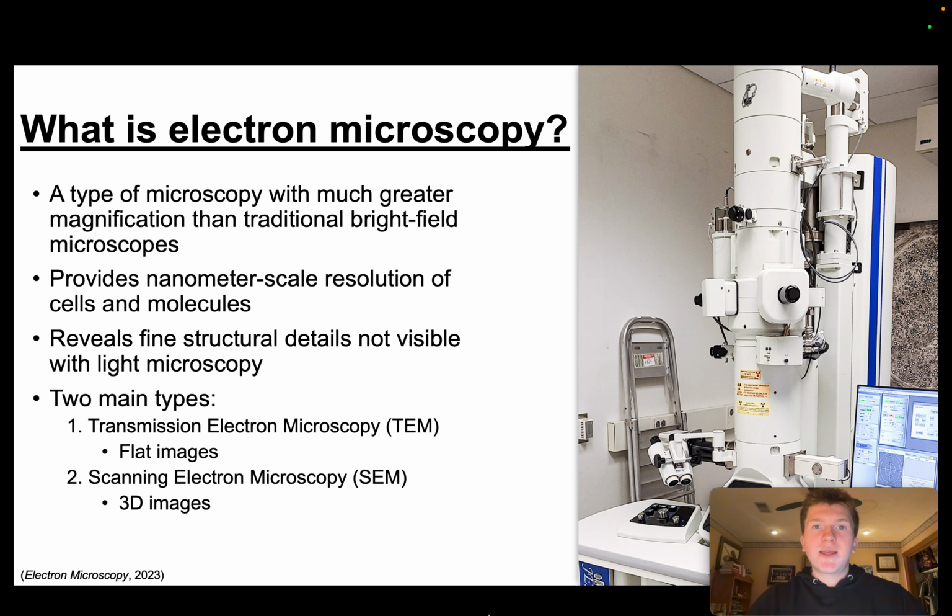There is TEM and SEM. TEM stands for transmission electron microscopy, and it is good for looking at flat images. SEM stands for scanning electron microscopy. It is good for looking at 3D images.